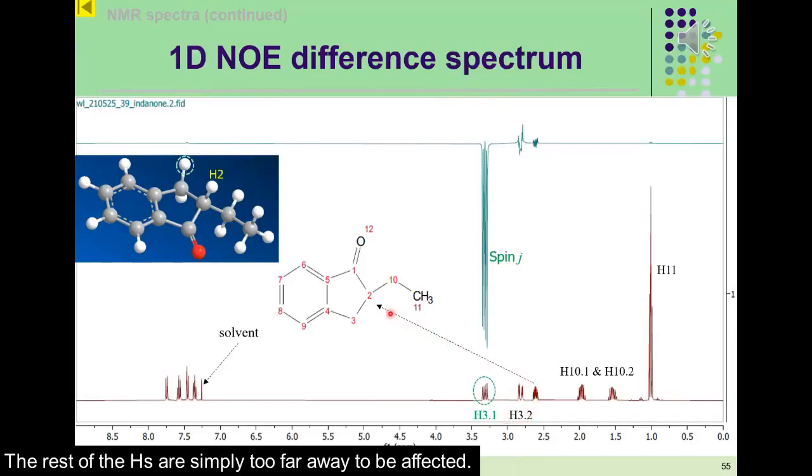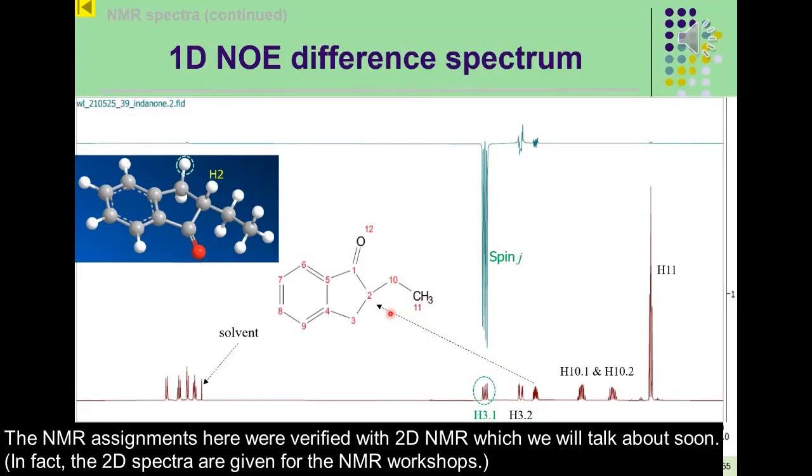The rest of the H's are simply too far away to be affected. The NMR assignments here were verified with 2D NMR, which we will talk about soon.